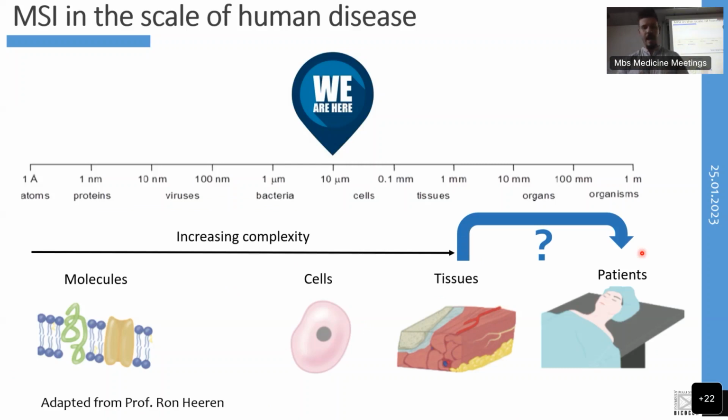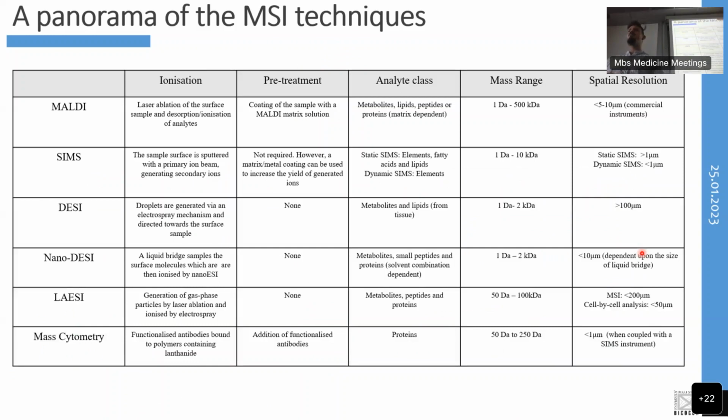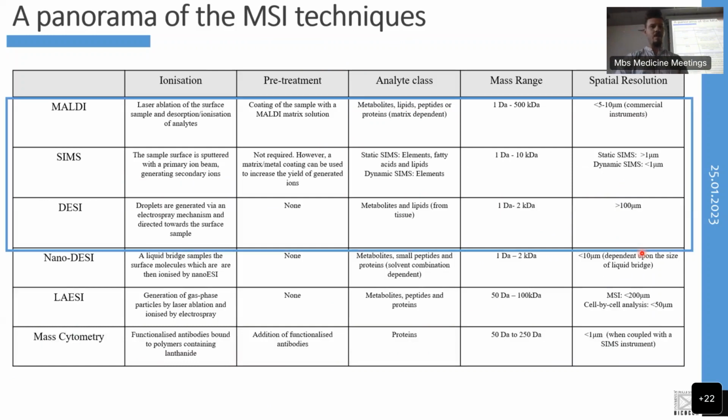And in English, we say there's more than one way to skin a cat, which effectively means that, the same with mass spectrometry imaging, there are multiple different types of it. There are multiple different technologies that we can use for various different approaches. And the most popular 3 are represented here. So DESI, which stands for desorption electrospray ionization, and then we have SIMS, secondary ion mass spectrometry, where you have a primary beam of ions, which is targeted on the surface of the sample, which ejects all these small elemental molecules. But from within them, we have MALDI.